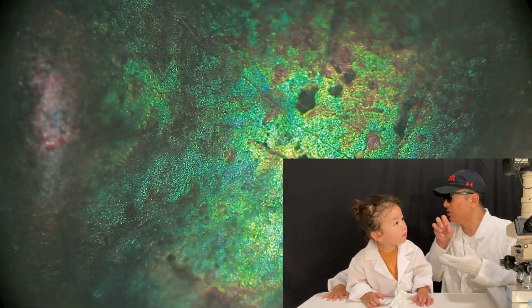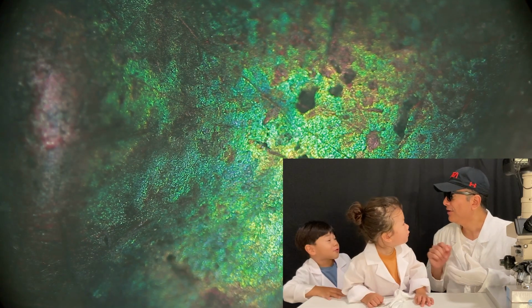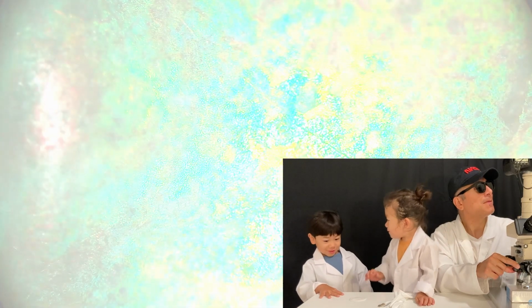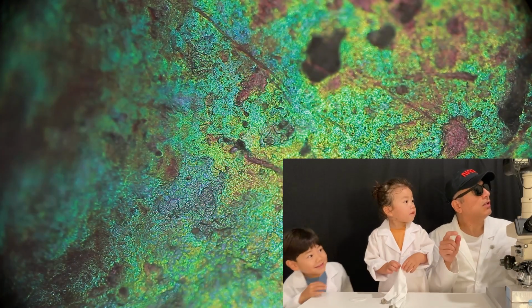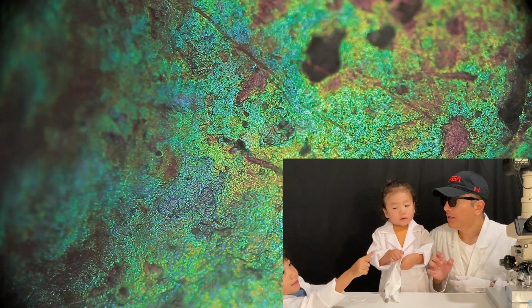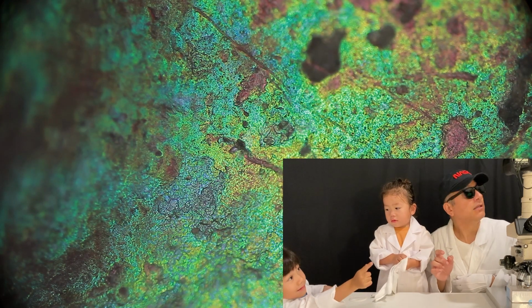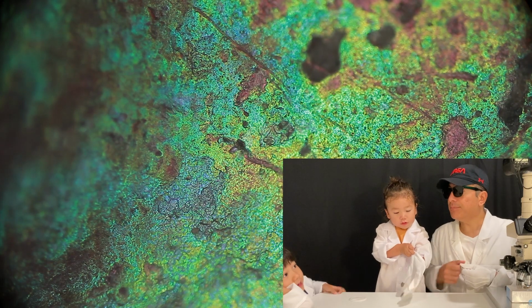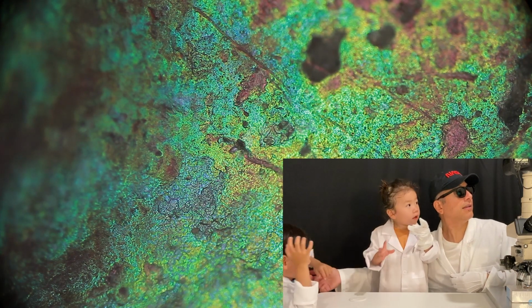This is the 5x. Should we go deeper? Yeah, we should go to 10x. We're getting closer. Look at that. And look, I see the green and blue. Yeah, look at his beautiful shell. And purple. And a little bit of pink.